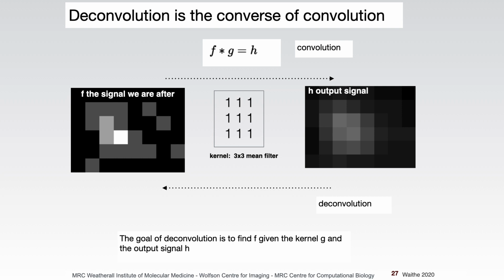Deconvolution is actually the converse of convolution. So this is where you would go from what we had as an output back to our input. In theory, this can be done simply by doing the converse operation. But in a practical setting, you don't tend to do deconvolution this way because there's an issue where 0 pixels can cause problems in the process.